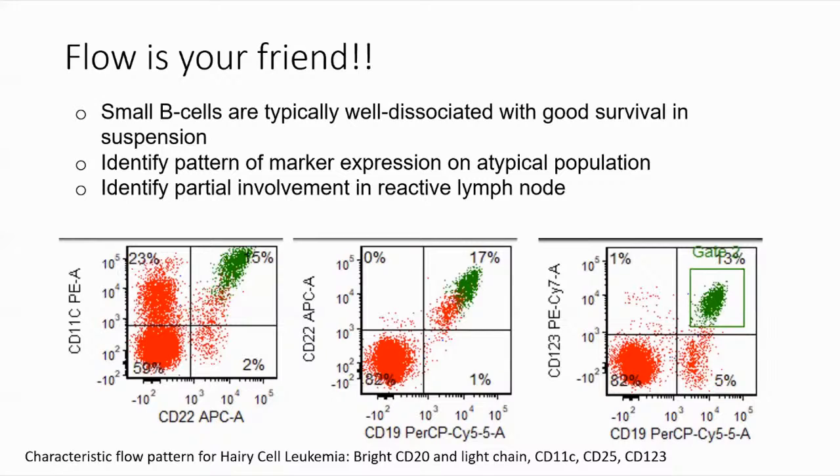And sometimes you may have CLL in the background, or some sort of monoclonal B-cell lymphocytosis in the background that's different from your main population of small B-cell lymphoma that you're dealing with. And so you can really tease out all kinds of intricacies if you've got the flow. And of course, classically, this is a hairy cell leukemia case involving the bone marrow. It shows very characteristic findings and co-expression of certain markers that can enable you to really nail that diagnosis if you've got that distinct pattern with the very bright expression of CD25, CD11c, and CD123 on those cells. So that's extremely helpful in those instances.